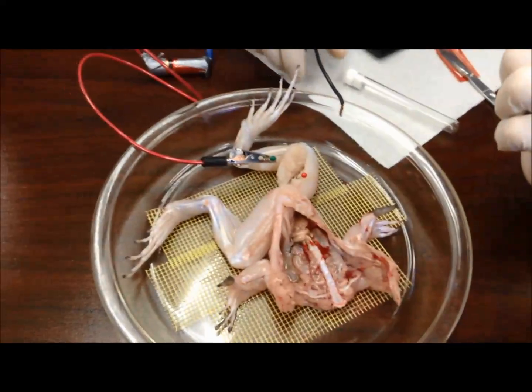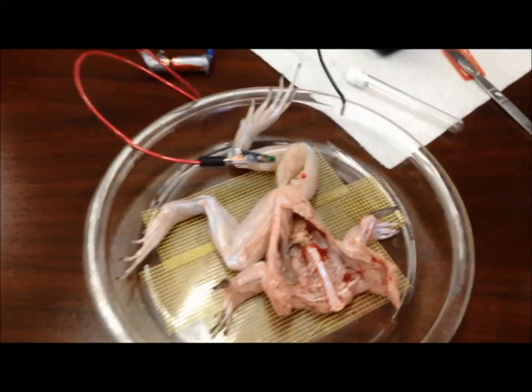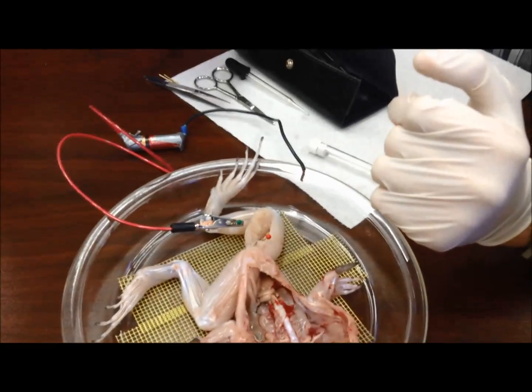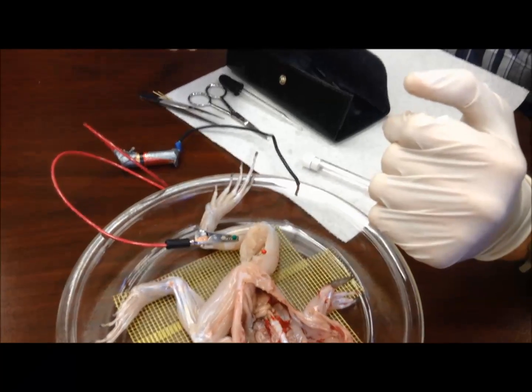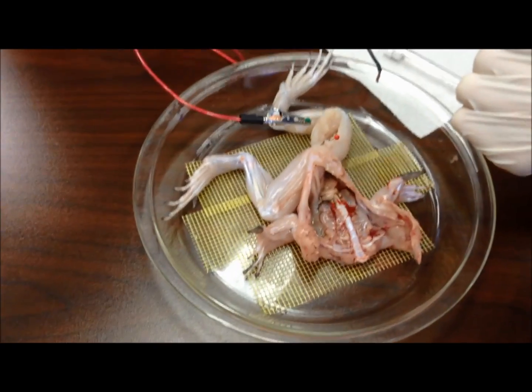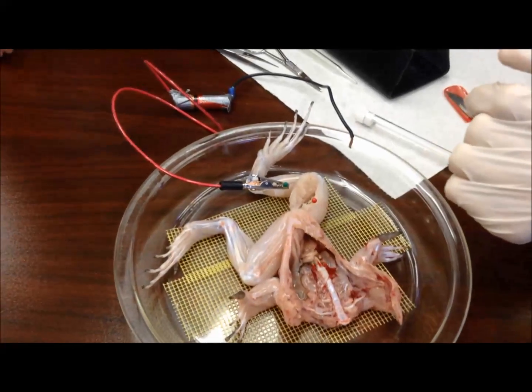It keeps it alive because your body needs salt, and that salt needs to go inside the cells to make sure — exactly, so the calcium is released. Salt is the electrolyte — it's something that allows charge to flow.